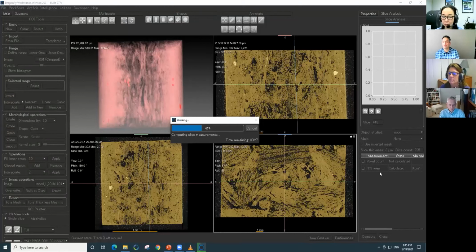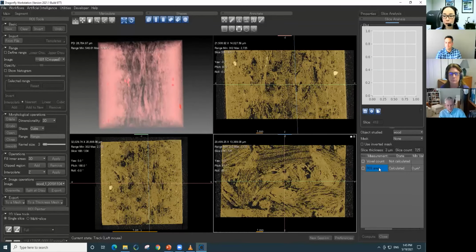What happens if you input the incorrect voxel size when you're opening up that TIFF image? That's a good question. If you put something grossly wrong, you probably will realize that you did something wrong, because that voxel size is used to calculate everything about the thickness or pore size, particle size, on all those things.